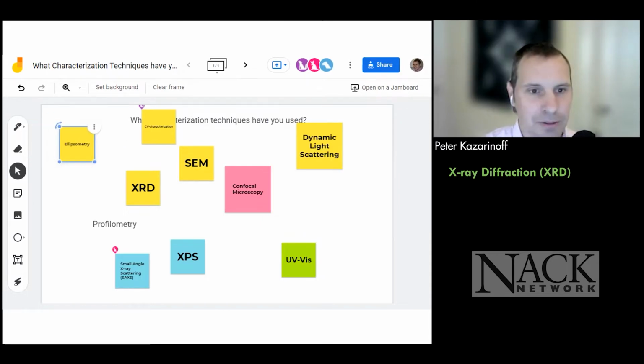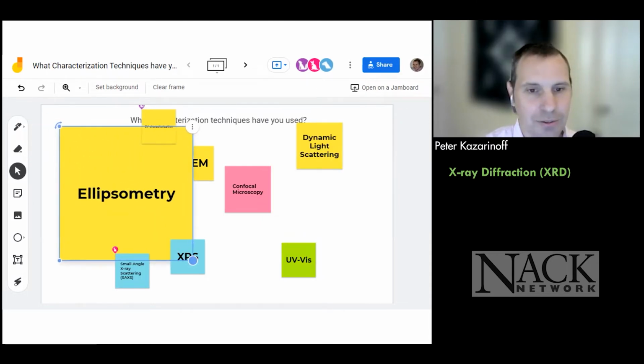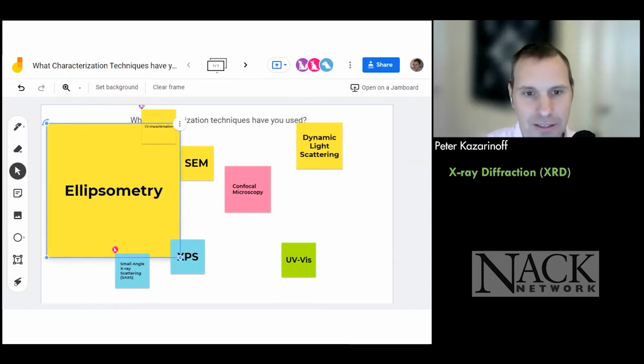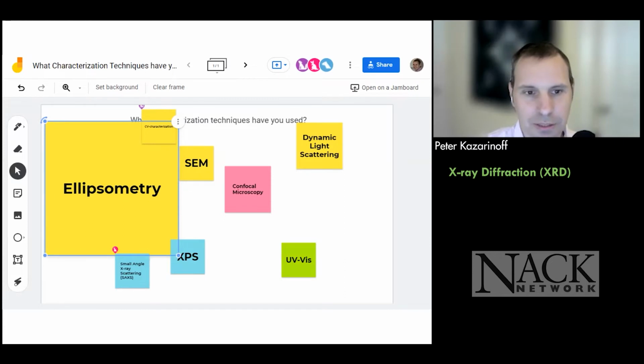Thanks. How about ellipsometry? Who put ellipsometry up there? Are you willing to turn your mic on? That's me again. That was you too? Okay, in a sentence or two, what's ellipsometry? Very shortly, we're coating silicon or growing some oxides, different oxides, not just silicon dioxide, and looking at the thickness of the silicon dioxide and the aluminum oxide by using laser light, trying to get the thickness of that material. And it's often used in things like semiconductor wafers, right?